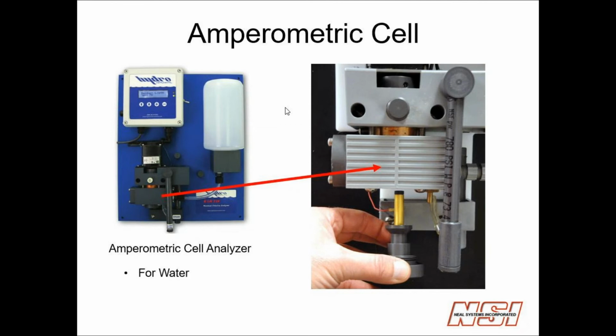These analyzers are good for water treatment, they're good for wastewater, and they tolerate solids very well. So this is the only type of analyzer that I personally would recommend for use in wastewater treatment. It's very forgiving, it's easy to clean. There is maintenance involved, but most of the other analyzers aren't that suitable for chlorine in wastewater.